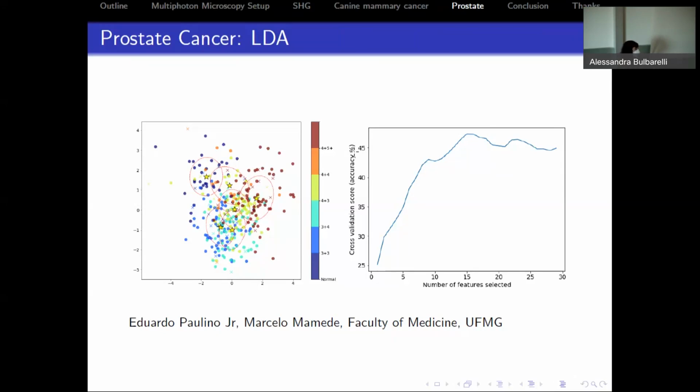And so what the pathologist and we are also discussing together is how to merge the 2 ideas to maybe get an extra way of classification, and how to compare that with the clinical data, because we are following these patients now for more than 2 years.